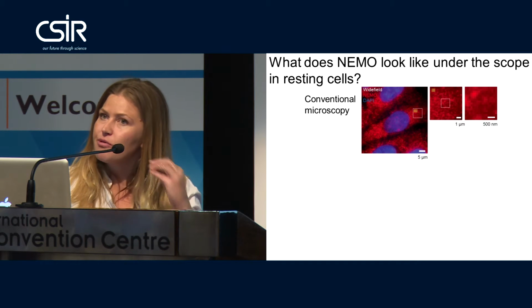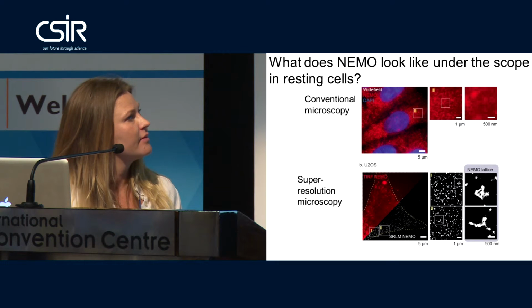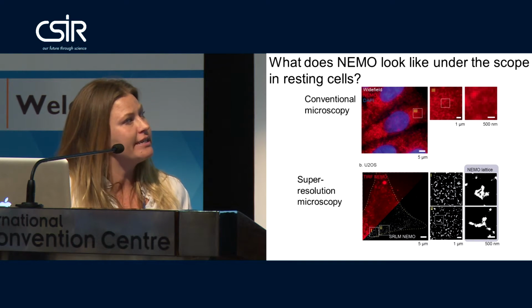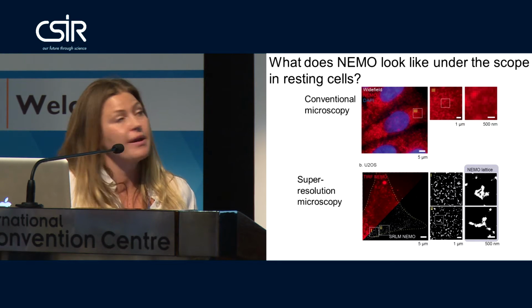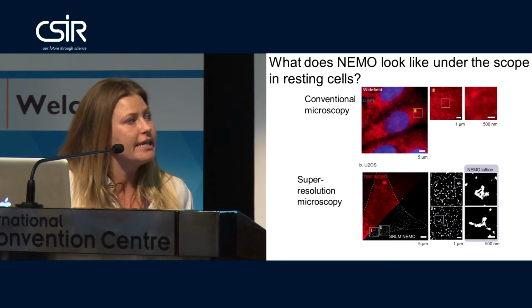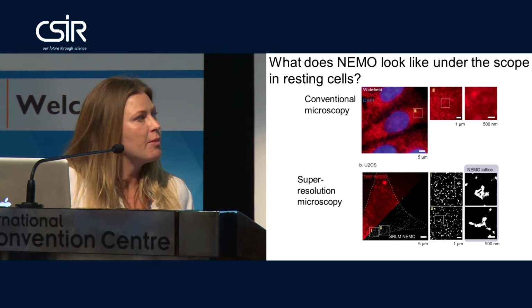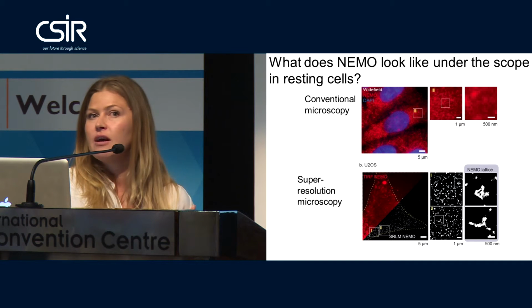If we apply super resolution microscopy to a similar cell, we see this. Again, at the same magnification as here, you can very easily start to see these higher order lattice structures that exist, compared to what we would see with a conventional microscope. And you can see that they do indeed extend almost over 1.5 microns. But because they're held together by those delicate bridges, it's only because of super resolution that we can see them.